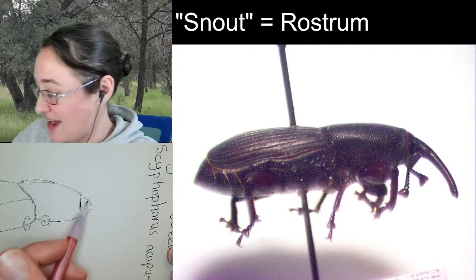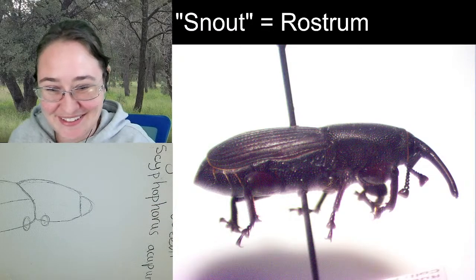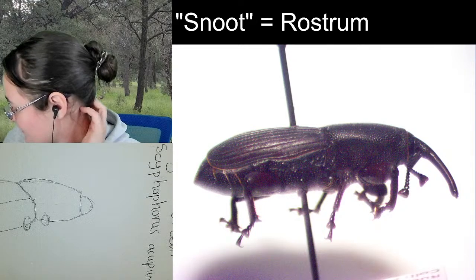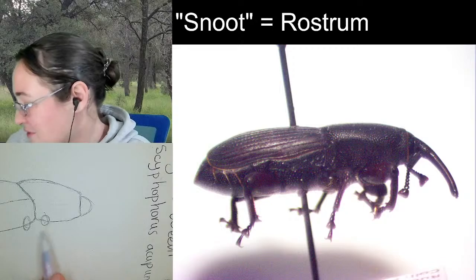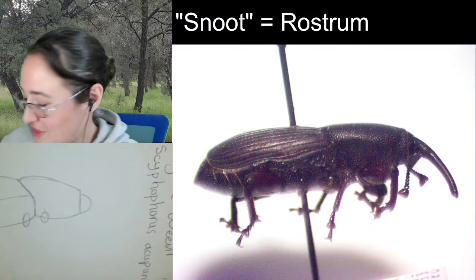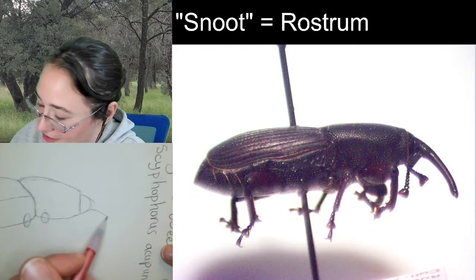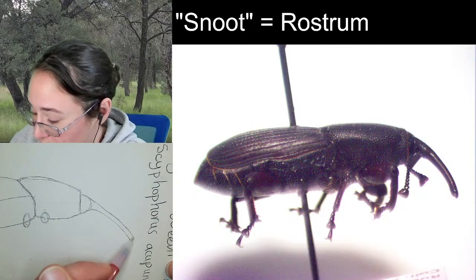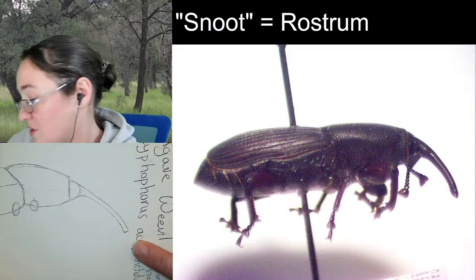If I want to get just now an estimate of the length of its snoot, it is about 1/4 of the body. That's a hard measure. I would say if you go to the size of the pronotum and pull that over, that looks about the right length. So we're going to take from the top of this head and the bottom of this head, and we're going to add the snoot that comes out. And it doesn't go all the way to a really sharp point at the end. In fact, there are mandibles here at the end. There are chewing mouth parts that it can use to chew into the agave plants.